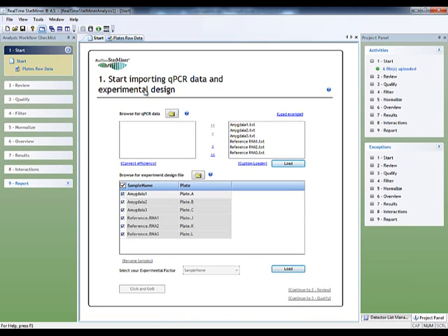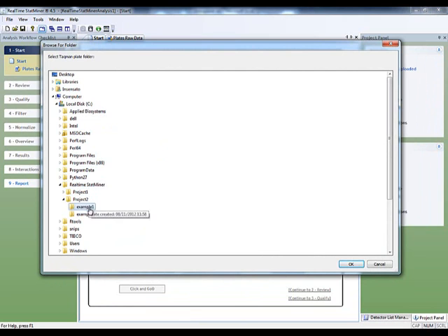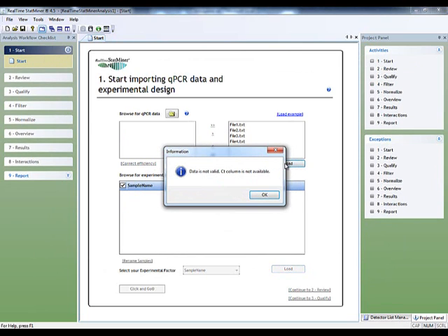If our data doesn't belong to supported platforms, we still have the opportunity to tell StatMiner how we could find such information within our data files, and that is exactly what is expected to be defined by us from the custom reader tool.